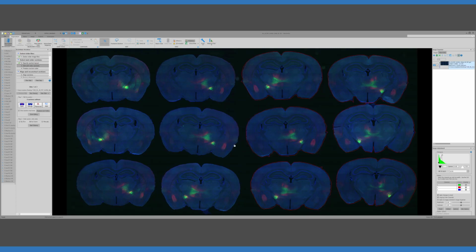I've already done this for these sections in preparation for this demonstration, and normally they wouldn't be outlined, but let me just start here. You can just hit apply and it'll recompute the outlines for you. Okay, Brian, who wrote the software, always has to remind me how to use this. Anyway, what it's done now is outline each of the sections. And so Brian's going to describe how this outlining works.